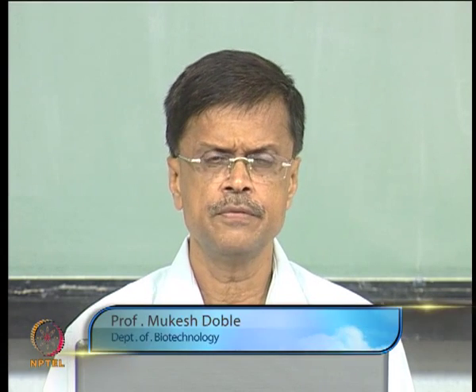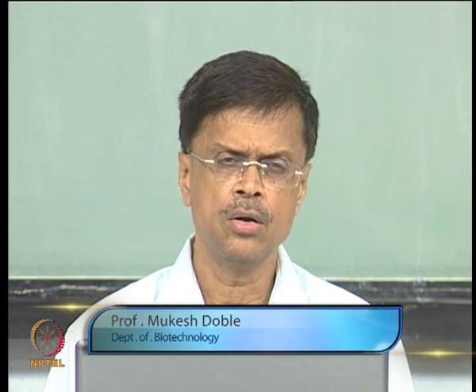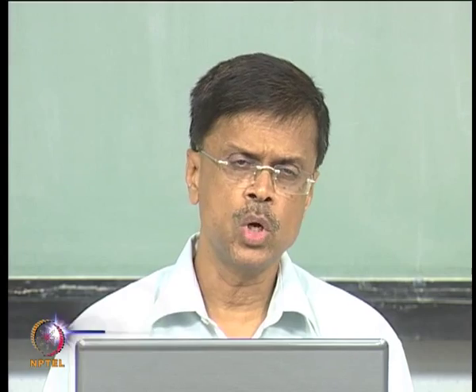In the previous lecture I introduced the various techniques that are used for breaking cells, whether bacterial, fungal or yeast, animal and so on. We will continue with the same topic this class as well.